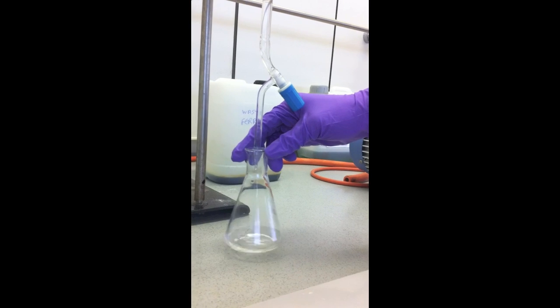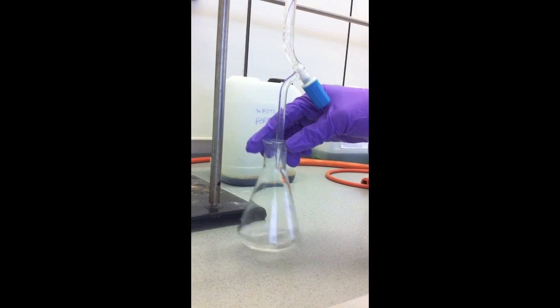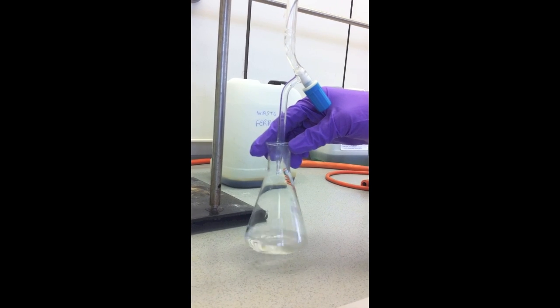Sodium borohydride was added slowly to the solution. Sodium borohydride is a very powerful reducing agent, so it would reduce the functional group on the reactant.